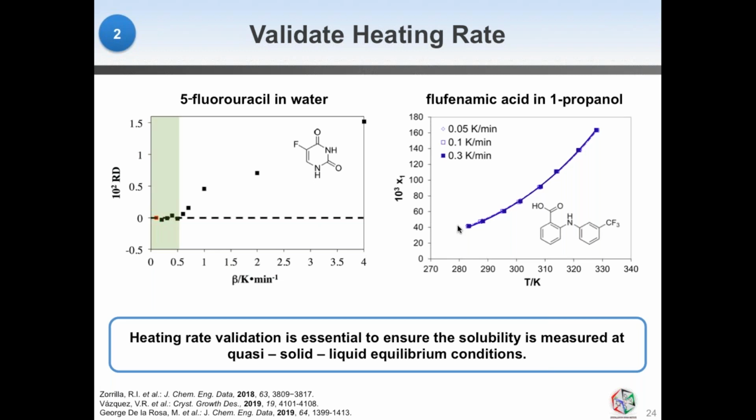I mean, it should be the same solubility. The attendee says now mixed API and the salt form. So most probably... Okay. The question is, is it meant here that we study a neutral molecule and a salt? A mixture? Most probably they make the salt from the neutral form and you have a mixed salt form. I mean, do we have experience with it?